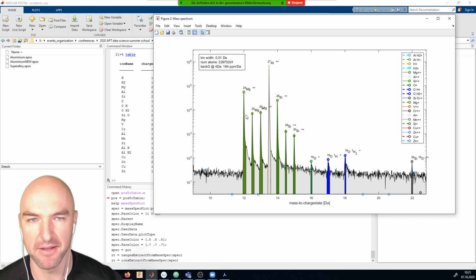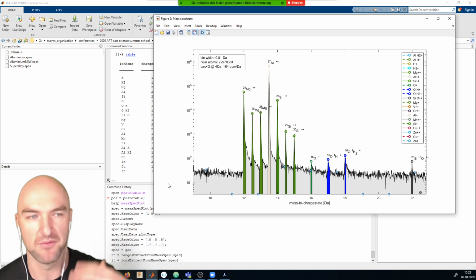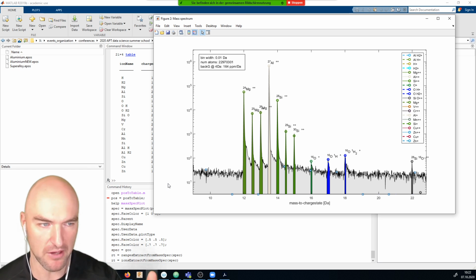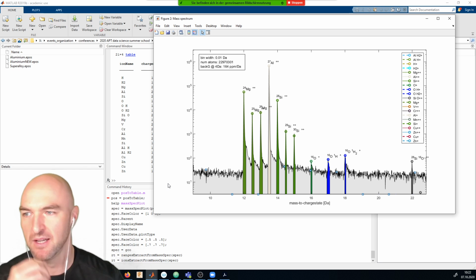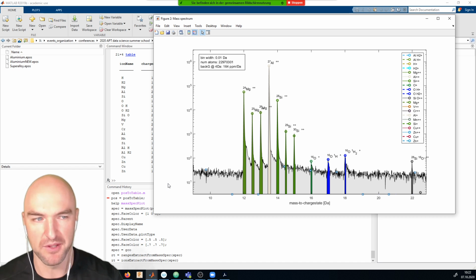And this is maybe a little bit different to what we've had so far in Atom Probe. So far we've only defined ranges. We define ranges and ions. And the reason for that is obviously we want to give you a platform to develop advanced mass spectrum analysis, for example, to calculate mass spectral overlaps by knowing which ions we have in there. So you can take the natural abundance from our abundance table and calculate which ions or what number of ions would be missing.